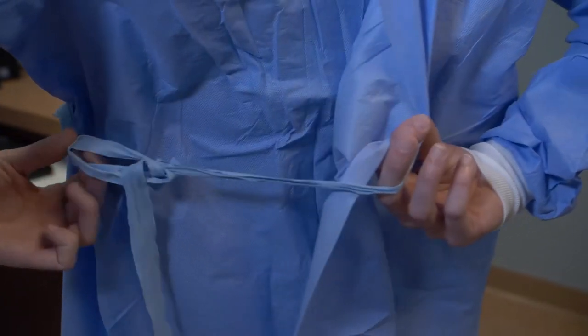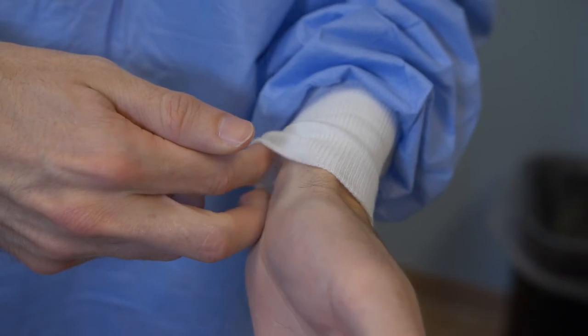Remove eyewear while avoiding placing your hands over the soiled lens. Untie the waist of your gown, then untie the neckties and wash your hands again. Slip your fingers inside the cuff of the other hand.